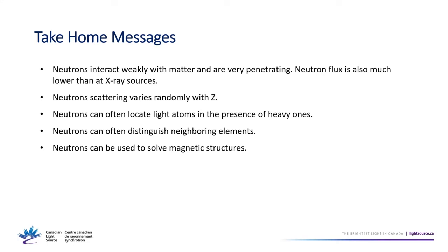Like I know at SNS they have kind of two diffractometers. They have one that's pretty close in, more for doing PDF of non-crystalline samples, the NOMAD one. And then they have POWGEN, which is a high resolution powder diffractometer, but they've also started doing PDF on that one too. It'll take a little longer, but your PDF will die off more slowly as well.